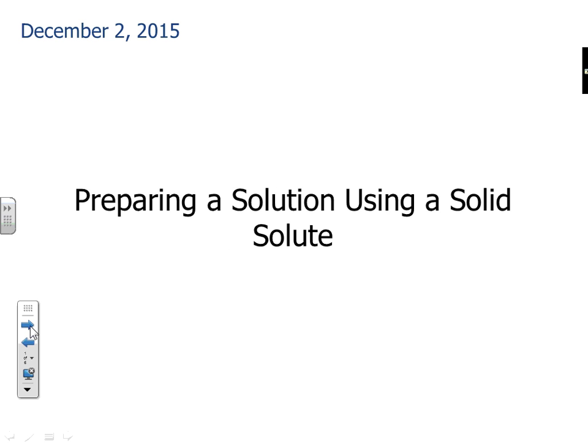The new part of it is the technique itself that we will be learning, and that technique is on how to make a solution. All right, so preparing a solution using a solid solute. So we're going to learn how we make a solution starting from a solid, and we're not going to just make any solution. It's not like we're making Kool-Aid and we're just going to dump some water in with sugar.